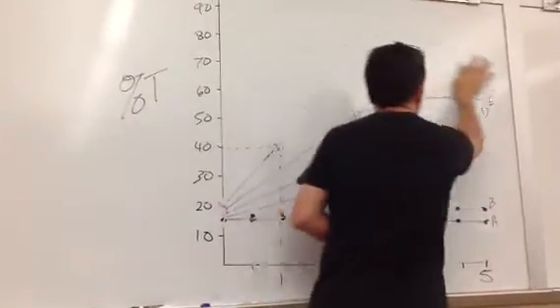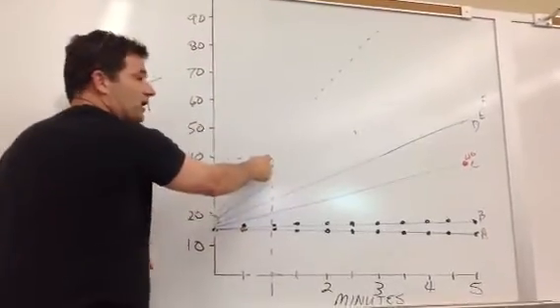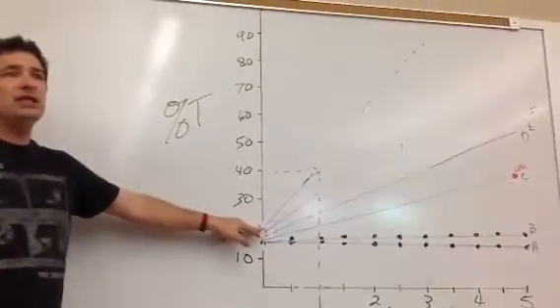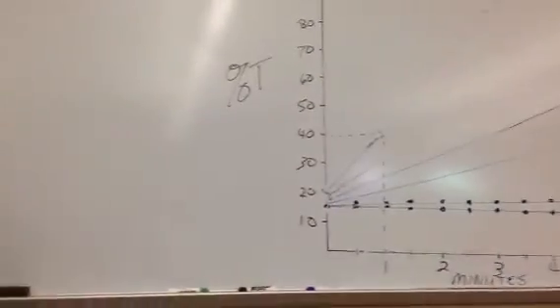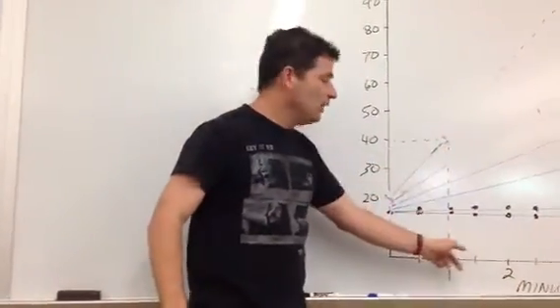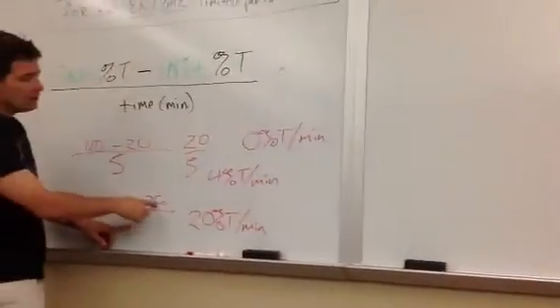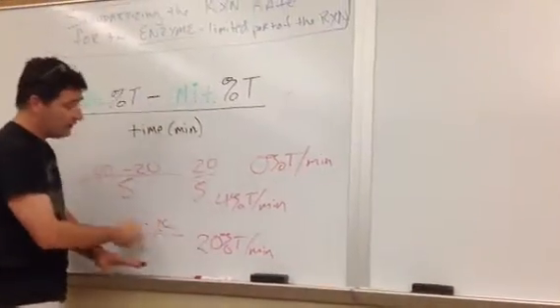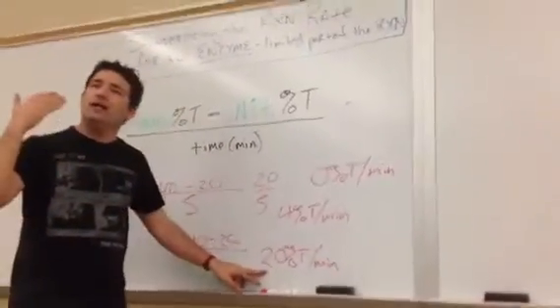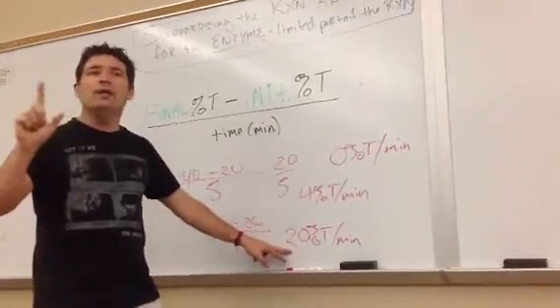No. So we're not going to even consider it when we standardize. We're going to say that is our final percent T at 40. This is the initial percent T at 20. So 40 minus 20. And how long did this run? 1 minute. So we're going to divide that by 1 minute. So 40 minus 20 is 20 divided by 1 is 20% T per minute. We want to get all of them in percent T, how much starch iodine cleared per minute.